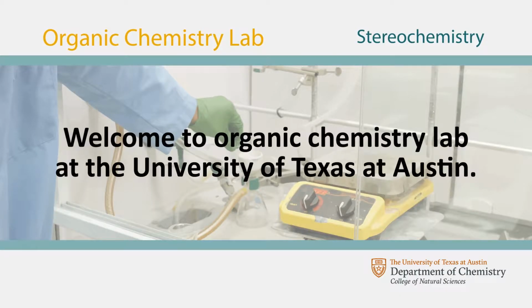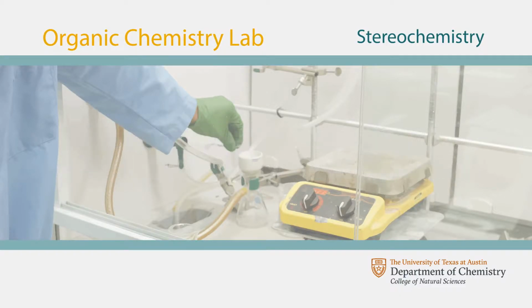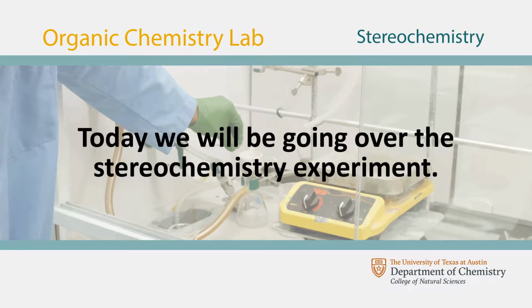Welcome to Organic Chemistry Lab at the University of Texas at Austin. Today, we'll be going over the stereochemistry experiment.